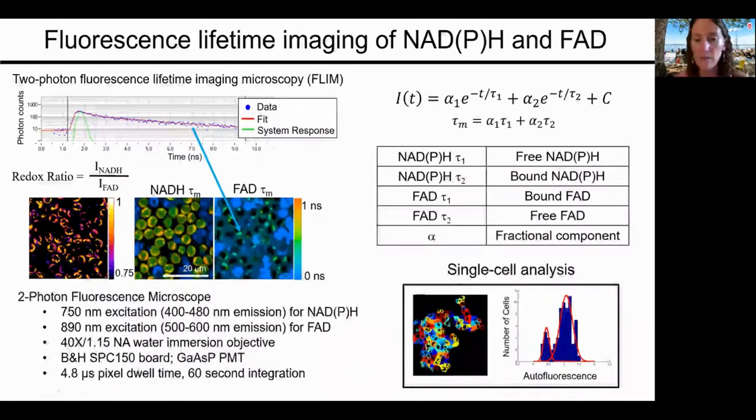We're also doing single cell analysis. So again, this is autofluorescence measurements. So we had to develop our own pipelines for segmenting cells, specifically cell cytoplasm. So we're segmenting out the nucleus and keeping the cytosol and mitochondria all together. And through this, we can then graph basically the number of cells and an autofluorescence variable, and then start to ask questions about the heterogeneity in those populations.